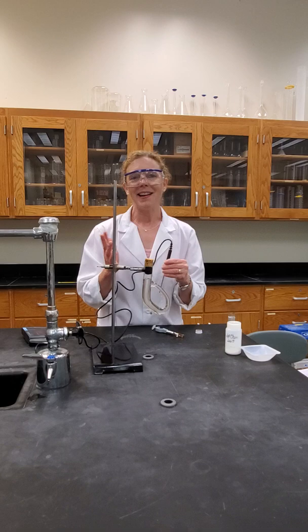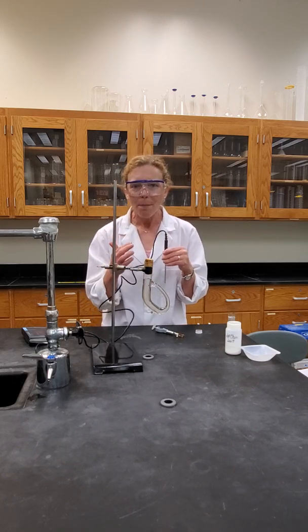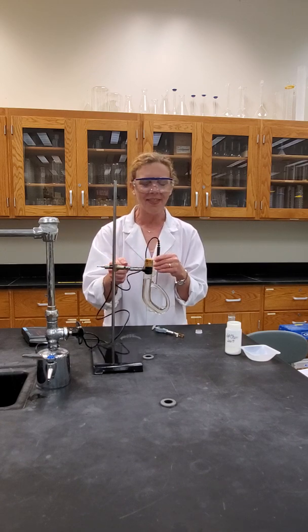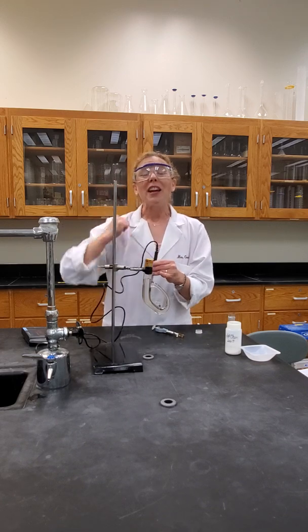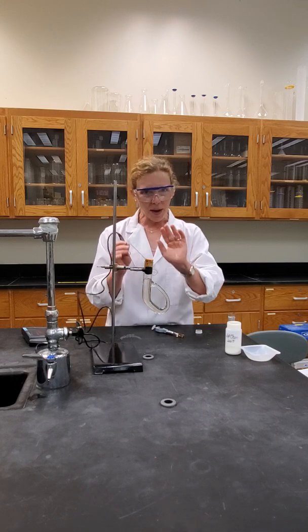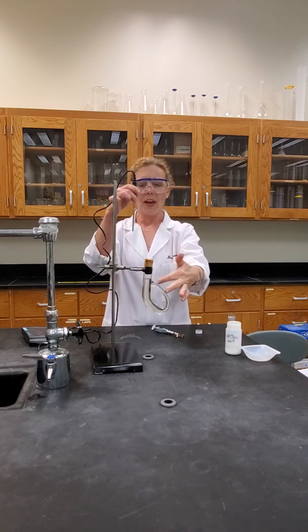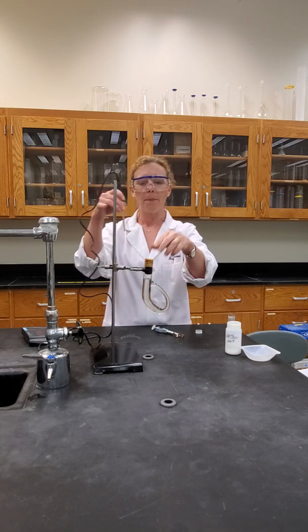Now, most Thiel tubes are filled with mineral oil. Mineral oil is just great at distributing heat nice and slowly and nice and evenly around the sample, a little better than water in a water bath. But similar in idea. However, it degrades when placed into contact with an organic substance. So we want to make sure that the rubber band, which is organic, does not get lowered and come into contact with the mineral oil. So try to keep the rubber band at the top.